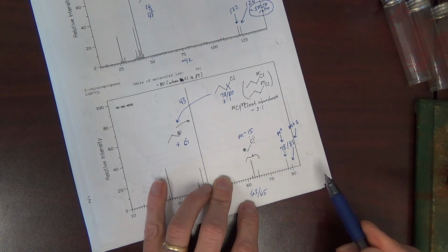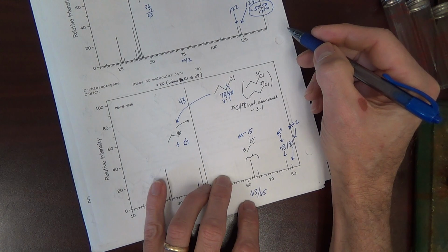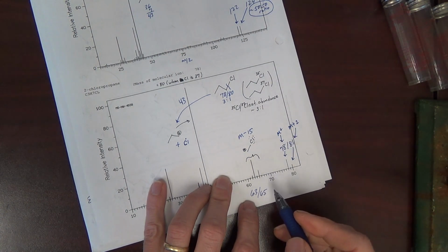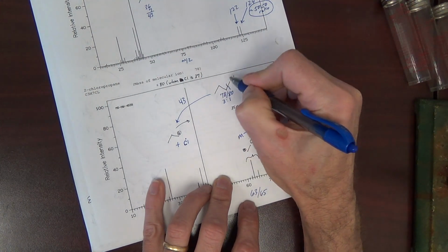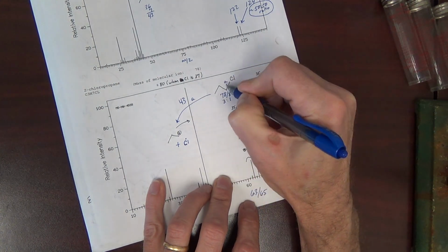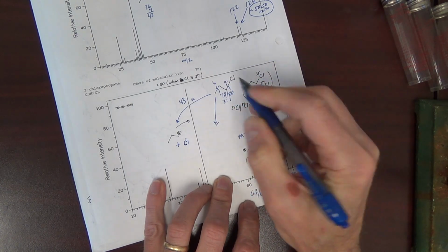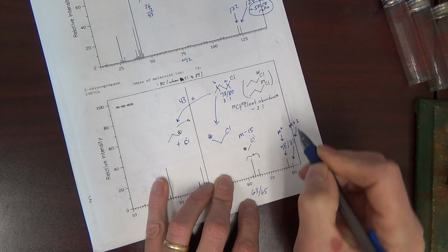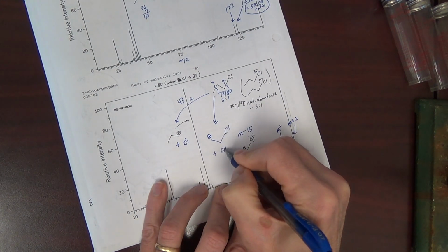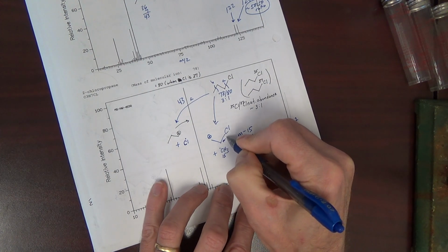Well, what could be 15? This is an error here, I believe. Loss of 15 would be, let's call that A. It would have to be here, B. And that would be, boom, boom, this cation plus CH3 radical. That's 15, so this is M minus 15.